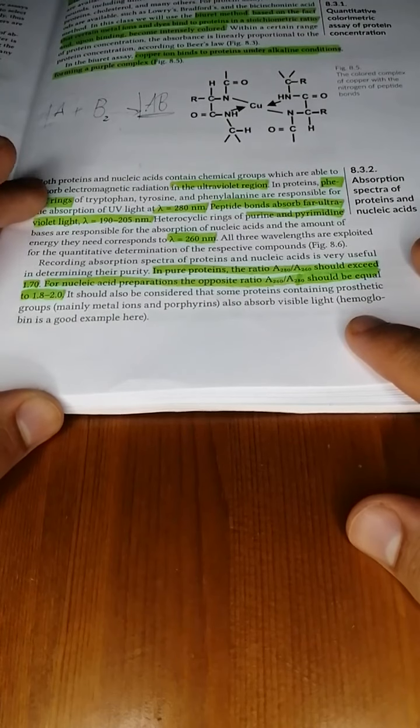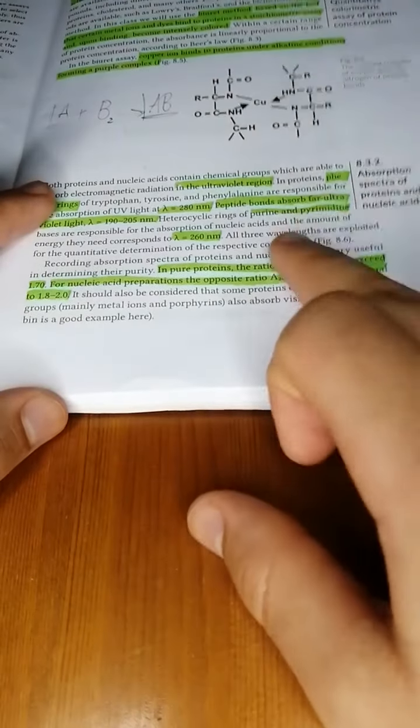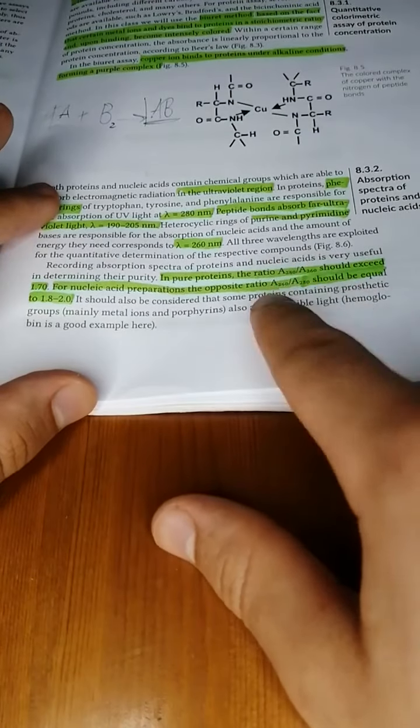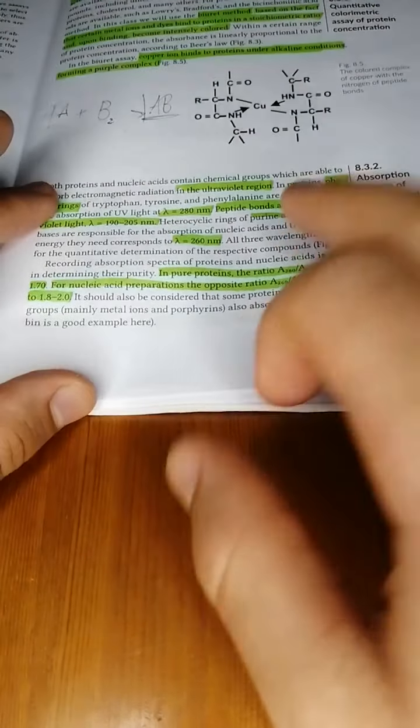It is by figuring out the absorbance of proteins at certain wavelengths and comparing that with the absorbance of the nucleic acids at the same wavelengths. That gives us a ratio.